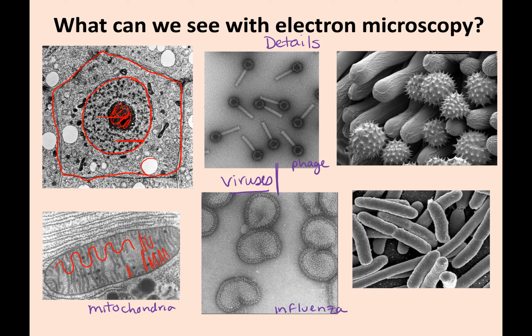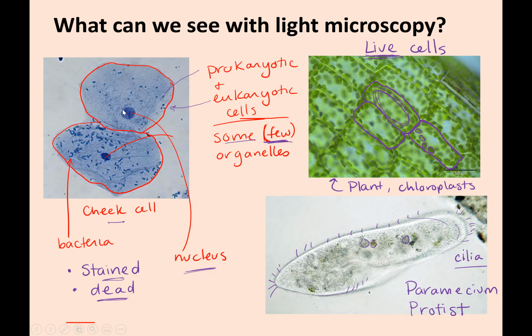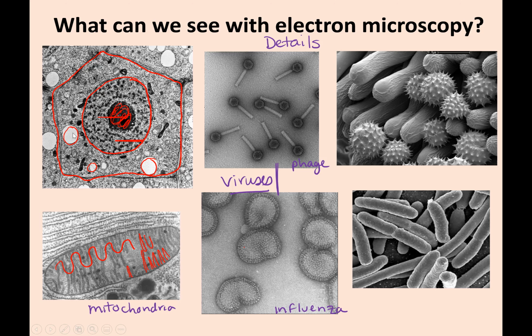We've got some vacuoles that are storing things. If we zoomed in, some of these are probably mitochondria, ER, but if you compare this to this image, you have a lot more detail.